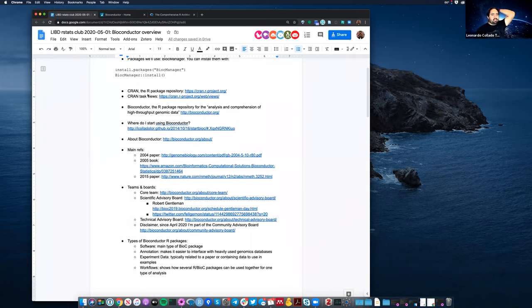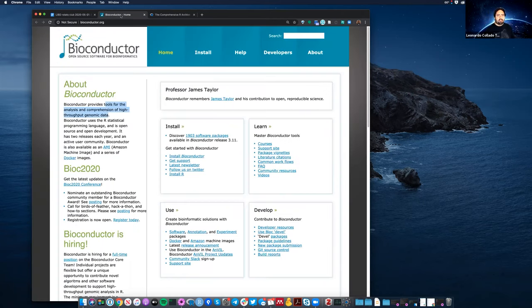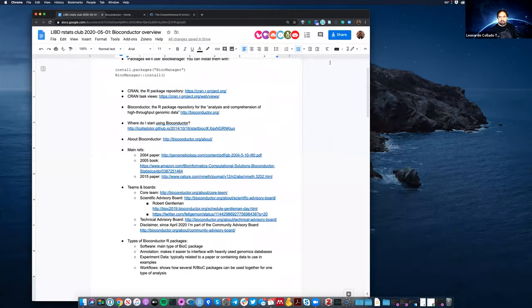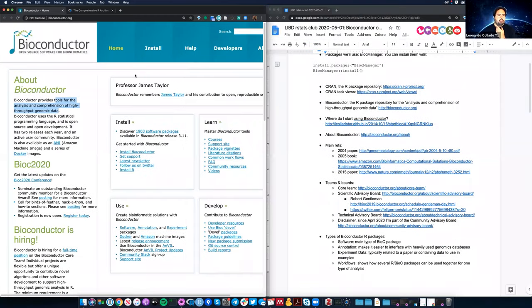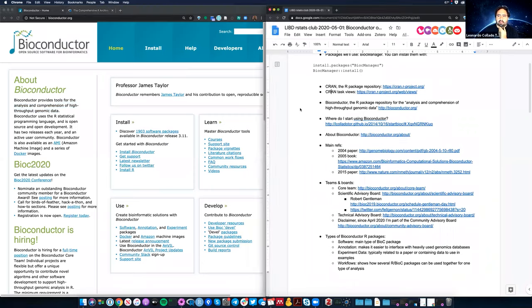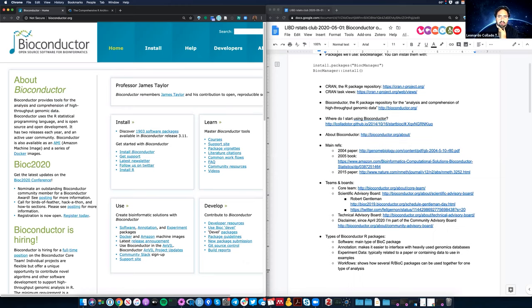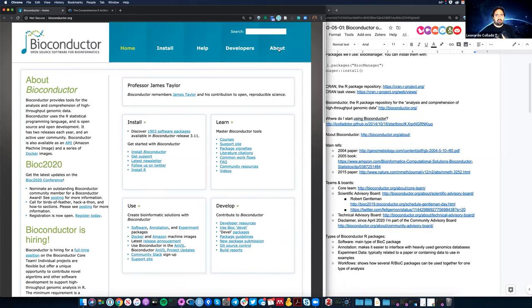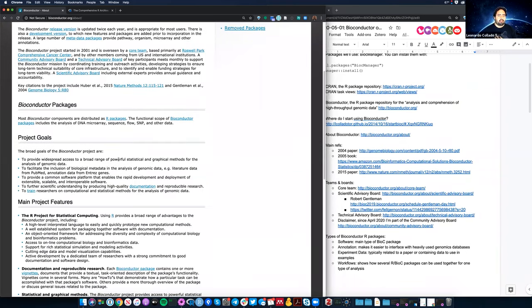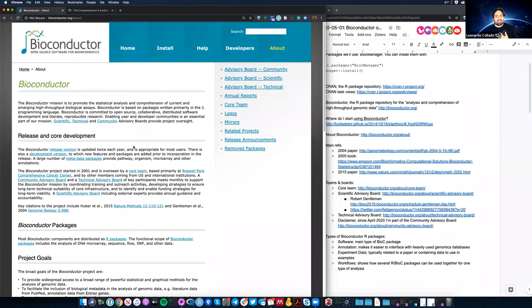The first thing I wanted to show is once you go to bioconductor.org. I'm going to talk about the About page. If you go to bioconductor.org, at the very top there's an 'About' link. We click on that and we get this long block of text — although it's been crafted to be as short and specific as possible — but this explains a lot of what Bioconductor is.